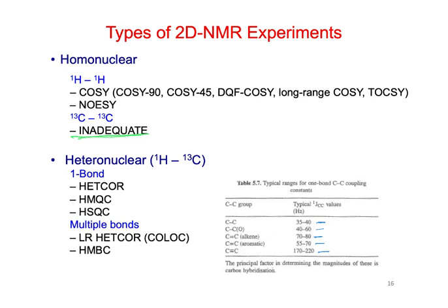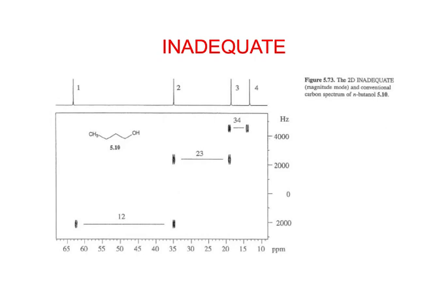So the way that this experiment works, well, we already talked about the issues of sensitivity. But the way that this works, and I have a hard time kind of coming up with it. So notice the right side of this is just in hertz here. 0 in the middle, and plus and minus. And so what the book said, this axis is the sum of the offsets from the transmitter frequency.